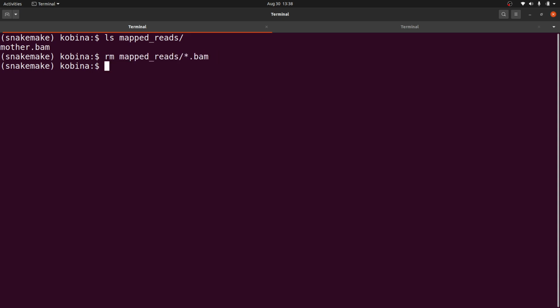All right. So you can also add this. You can add another rule in the snake file itself, and then whenever you call Snakemake, you can specify that rule to do the clean, aka remove the files. Okay, so that's something you can also do later on. But for now, I will do the removal outside Snakemake. But it's a rule you can add, and then that will also make your work easier, especially if you are going to be removing multiple files or different files. So you can add this rule to it, and then you can just do that. So let's do this. I think I'll just add it so that I'll use that to show you something.